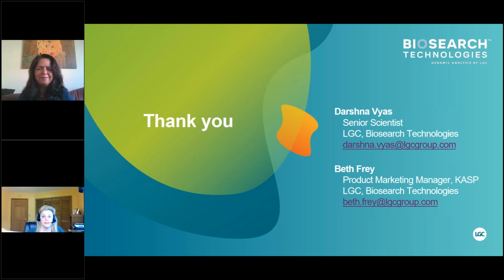When designing KASP assay primers in polyploids, is it more desirable to have subgenome homology with the SNP or with the SNP present in only one subgenome? So we have an option which we didn't talk about in this particular webinar, was the fact that we can actually anchor our KASP assays to particular subgenomes. So having information on the homology to a specific subgenome is extremely useful.